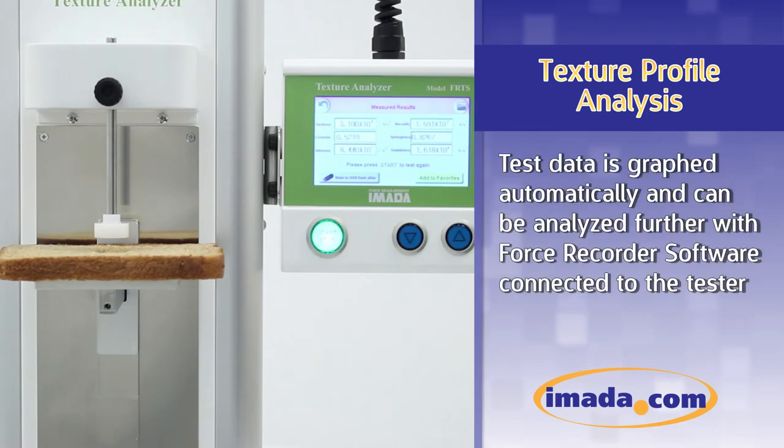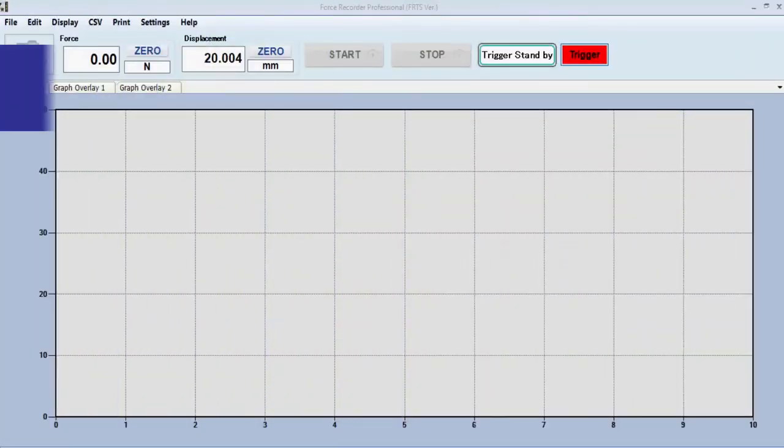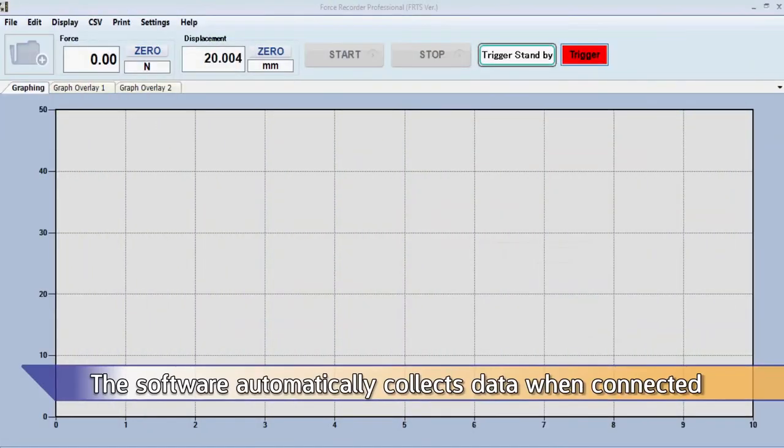Test data is graphed automatically and can be analyzed further with Force Recorder software connected to the tester. The software automatically collects data when connected.